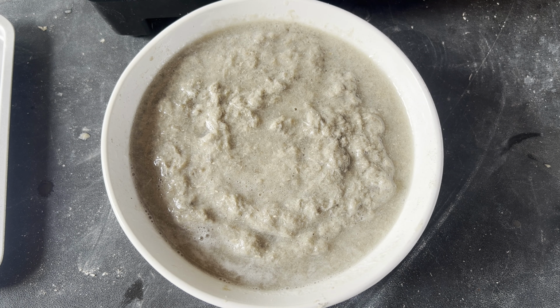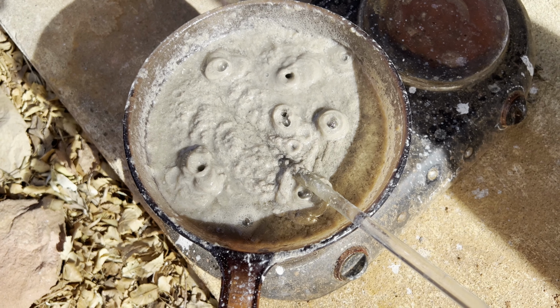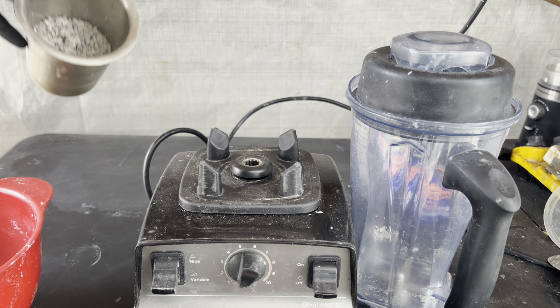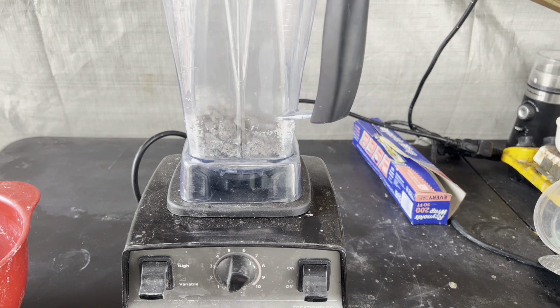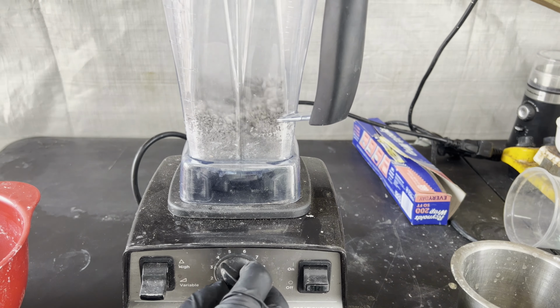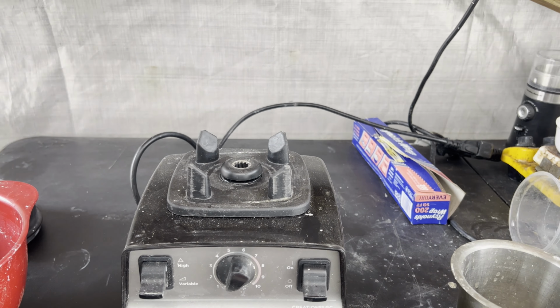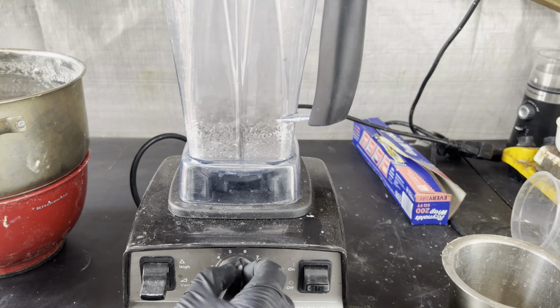The thickness of the felt can be varied depending on the nature of what's being filtered. For crystalline media, it would be a thin layer. For fine precipitates, it would be a thick layer. The crucible containing the felt is ignited and can then be used for the estimation of precipitates. There's more on its use and some variations, but that's beyond the scope of this video.